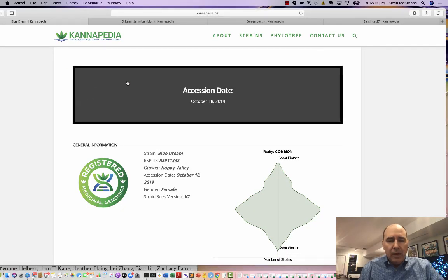All right, good morning. Today we're going to go over how to interpret your DNA sequencing results from a Strainseek report. There's several different ways that we sequence for clients. Strainseek is one of the more popular ones. This sequences about 3.2 million bases in the cannabis genome. This is different than the whole genome sequencing service we have, which sequences every base, over 800 million. But the Strainseek tool is a good, cheap way to get in and get some surveying done.